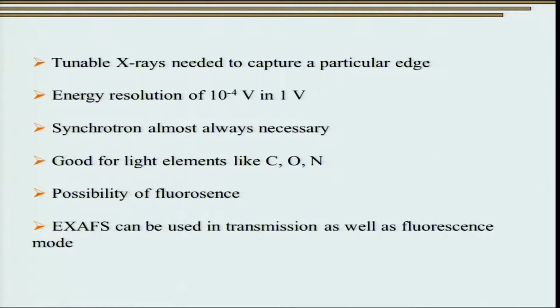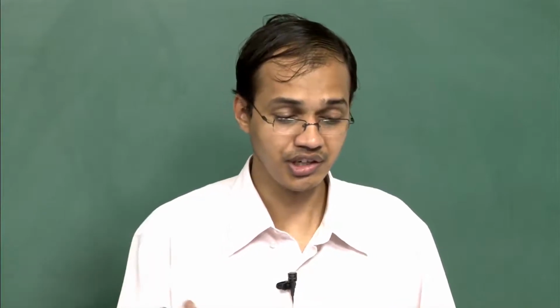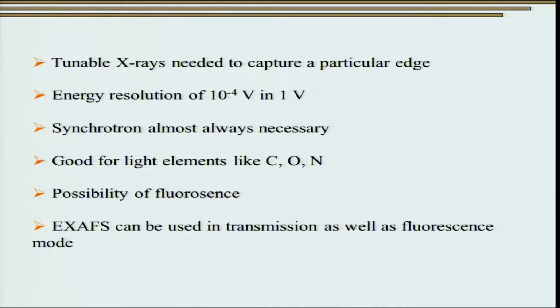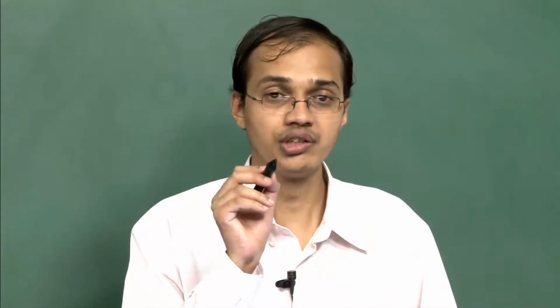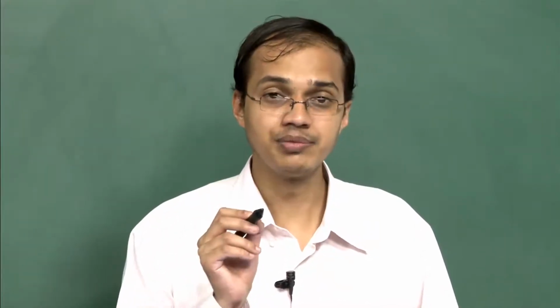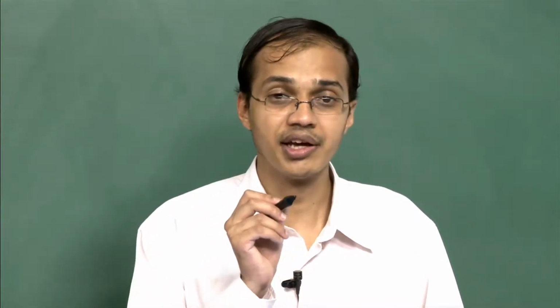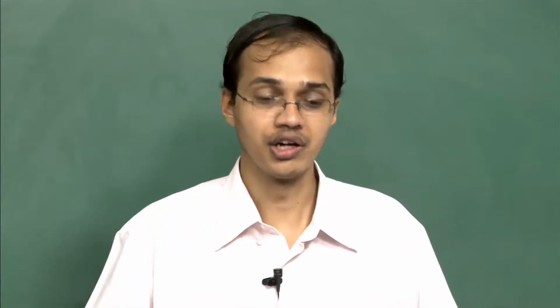class of materials. However, EXAFS is not really as common as other spectroscopy techniques, right, like EDS, and the main reason for that is we need tunable X-rays to capture a particular edge. I hope you appreciate that whenever I showed the earlier images, we were going at a particular value of the absorption edge, and this means we need a source for X-rays which can give us energy over a particular range.